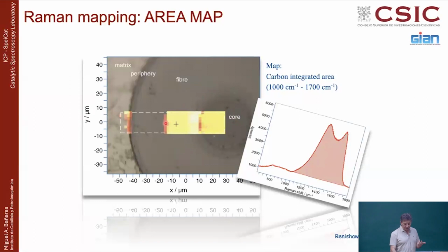Here you see that this is the end of the carbon fiber, and over here you have something different, which is the silicon carbide. And then outside of this carbon fiber, you get some debris of broken carbon fiber pieces, so you again see some Raman signal of carbon fibers, very weak, very random, very scattered, because this is not the material, it's just outside garbage, litter that you get out there. You could also look at the map and integrate the band associated with silicon carbide, so these areas will be empty. And over here you will have a nice color telling that you have silicon carbide. So you can combine this kind of information.